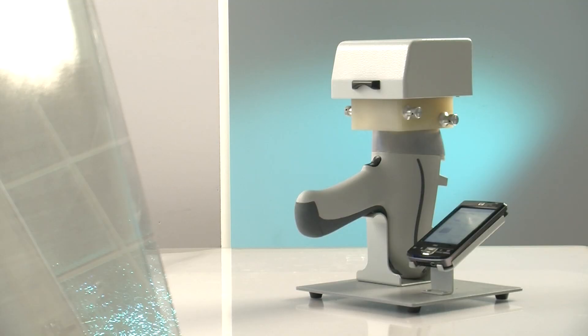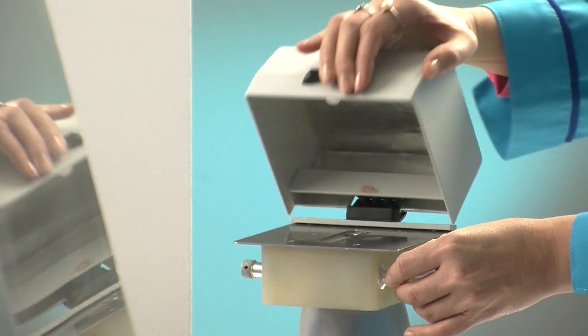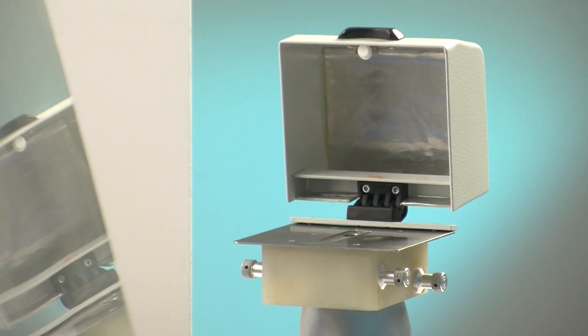For testing small objects, a laboratory stand can be used. Liquids and powders analysis becomes as easy as it is with a benchtop system.